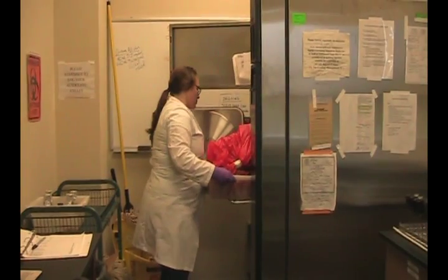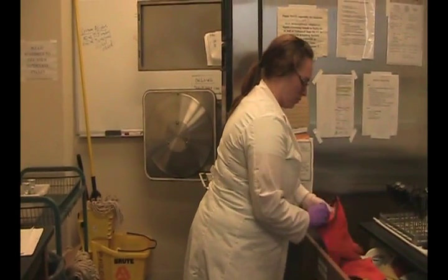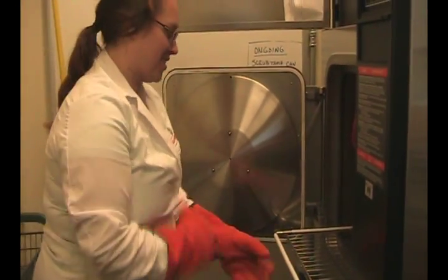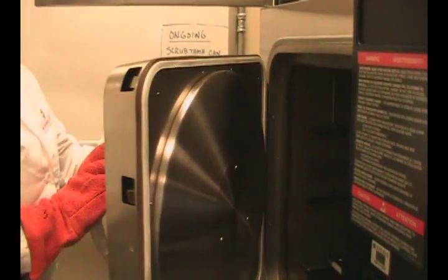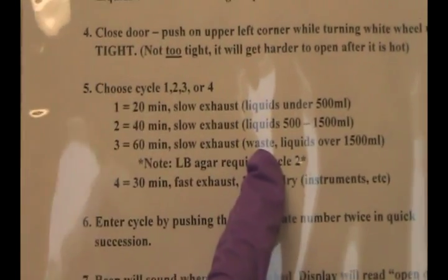Only one bucket fits in the autoclave at a time. Don her heat-safe gloves to push in the grate. Push it into the chamber. Seal the door. Check the cycle sheet — in this case, for waste, it's cycle 3. Back to the front to start the cycle.